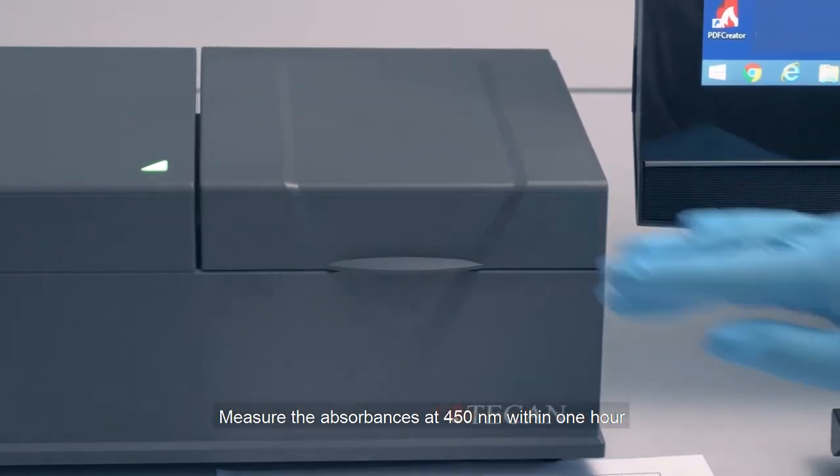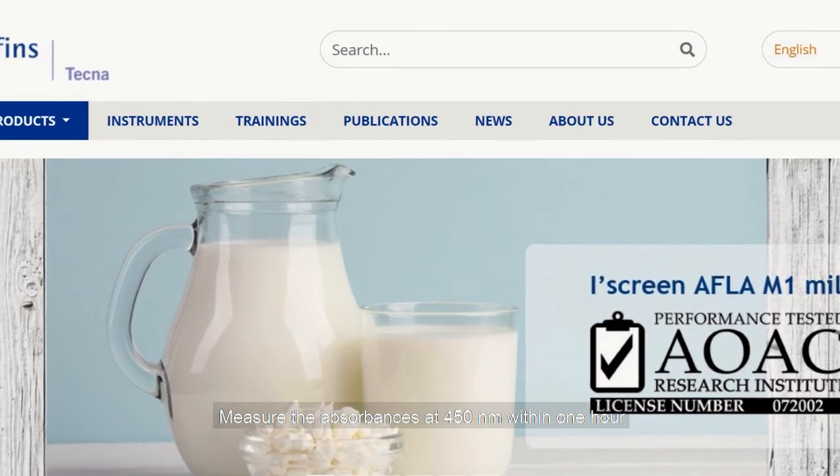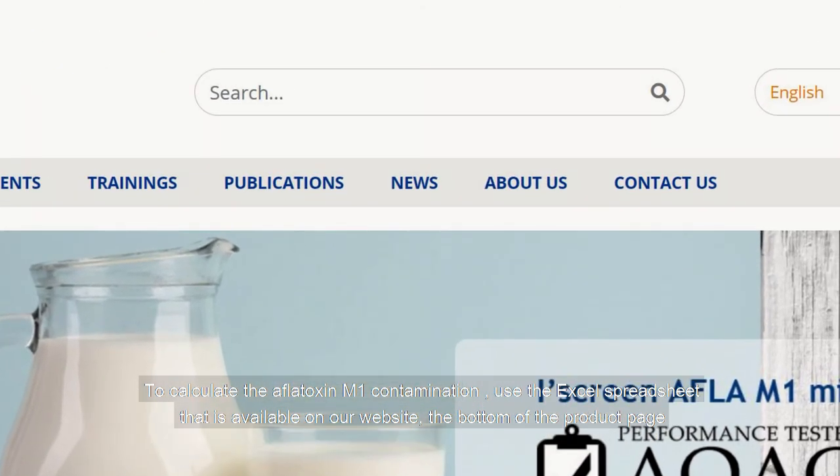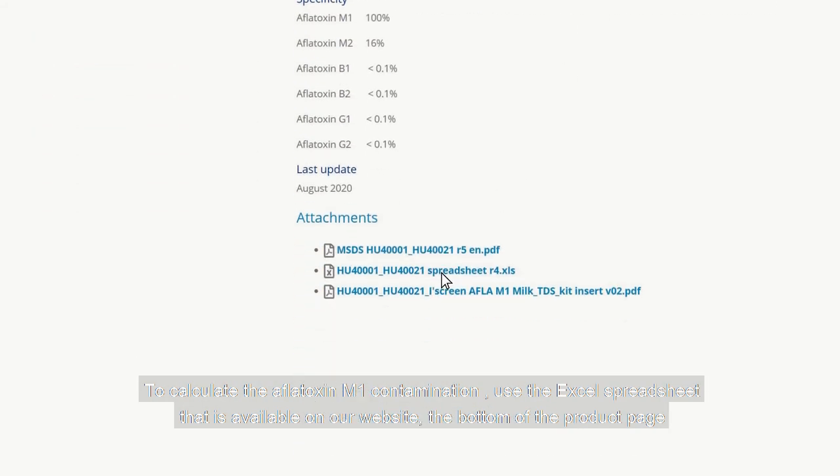Measure the absorbances at 450 nanometers within 1 hour. To calculate the aflatoxin M1 contamination, use the excel spreadsheet that is available on our website at the bottom of the product page.